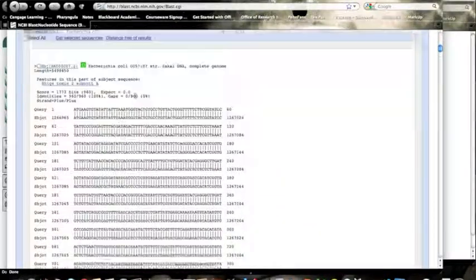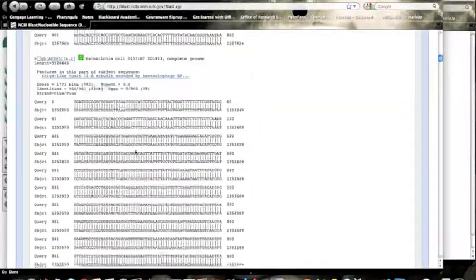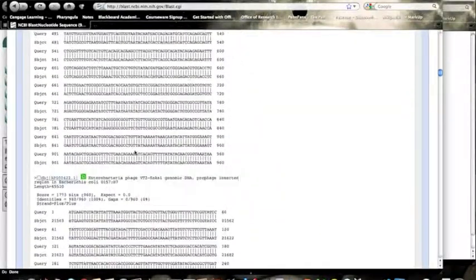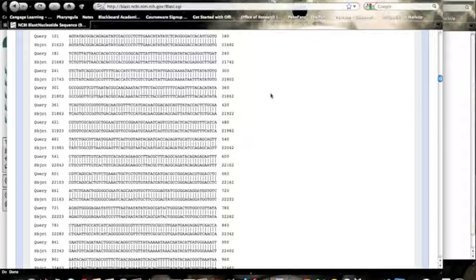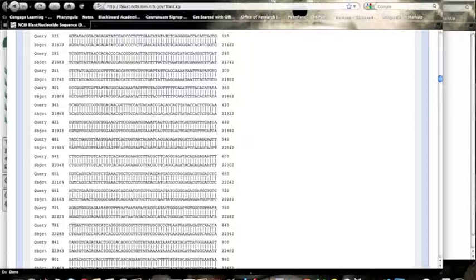And if you look, you see very good alignments of these sequences. So this tells us that we do have a gene that's showing up in this organism.